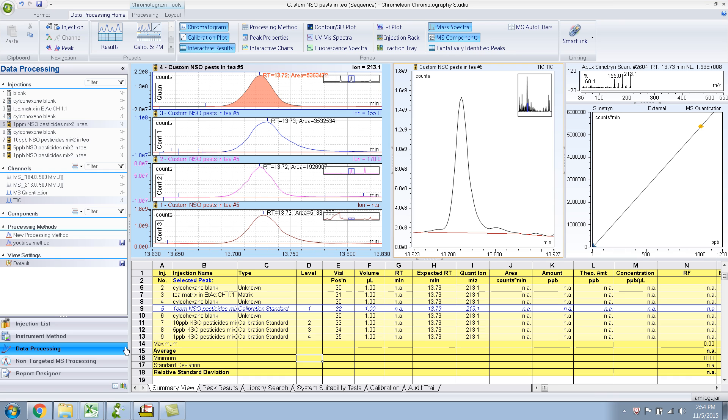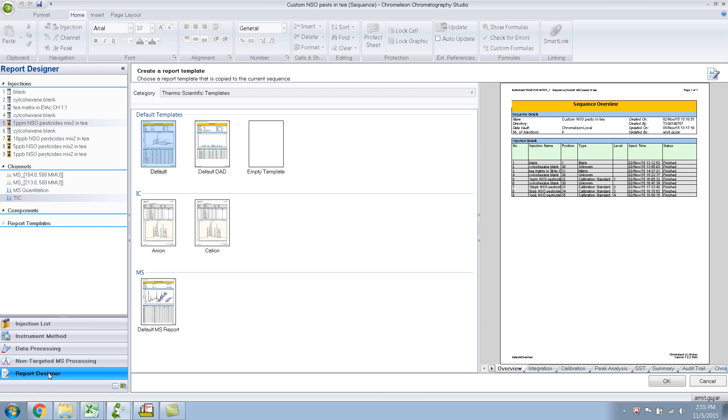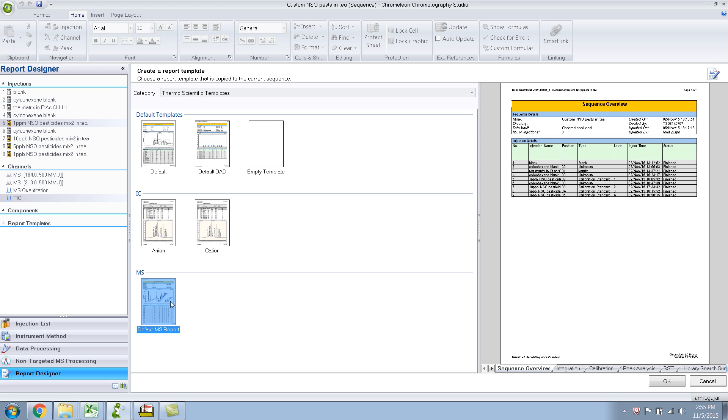Okay, so this is part 6 of the Data Processing in Chromelion for GCMS video series. In the last part, we learned about how to do a calibration plot. Now this time I'll show you how to do reports. In many commercial labs, reporting is very important. So what you do is, over here you'll see a report designer where you click. Since this is the first time we are creating a report, it gives you an option to choose a template. So, create a report template. Since this is mass spec data, you would use the default MS report. And just click OK.